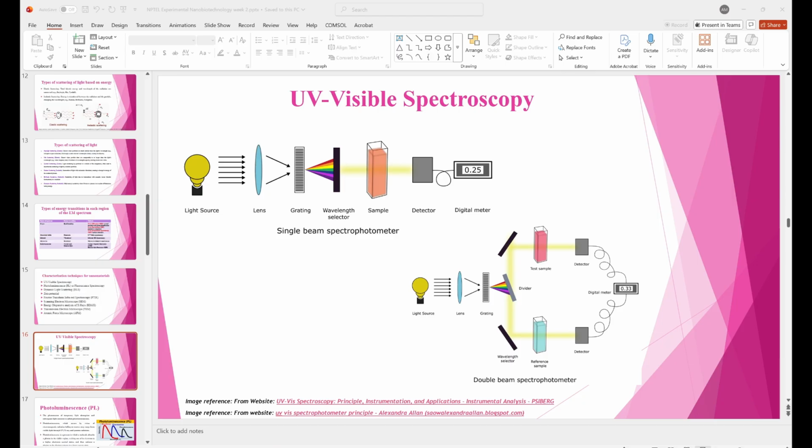It should not be like half of the light is passing through your sample and then half is passing through just the cuvette. Okay, so only that much amount of sample you need. You do not need to fill completely 3 ml. So as a rule, we just fill up 2/3 of the volume, and then you pass the light and the detector is at 180 degrees, and it will give you a value for absorbance.